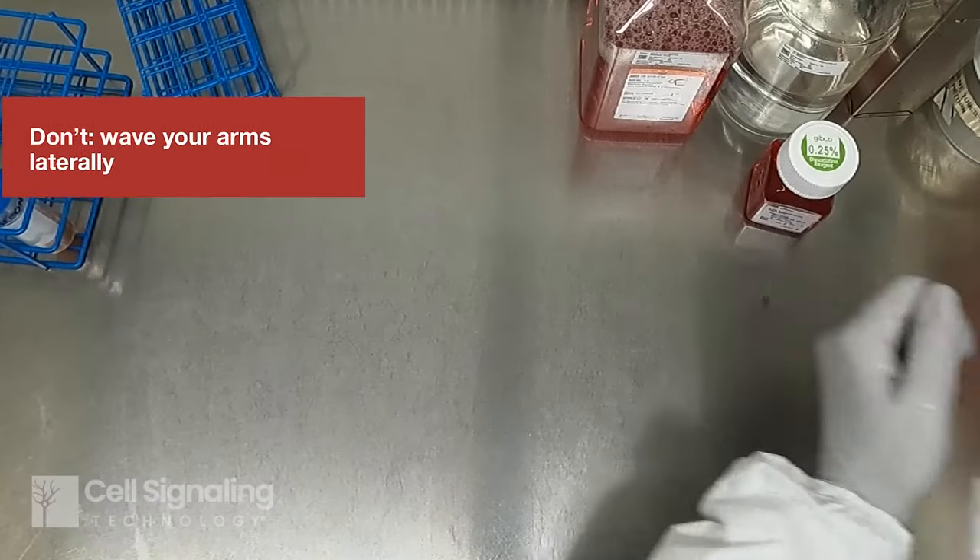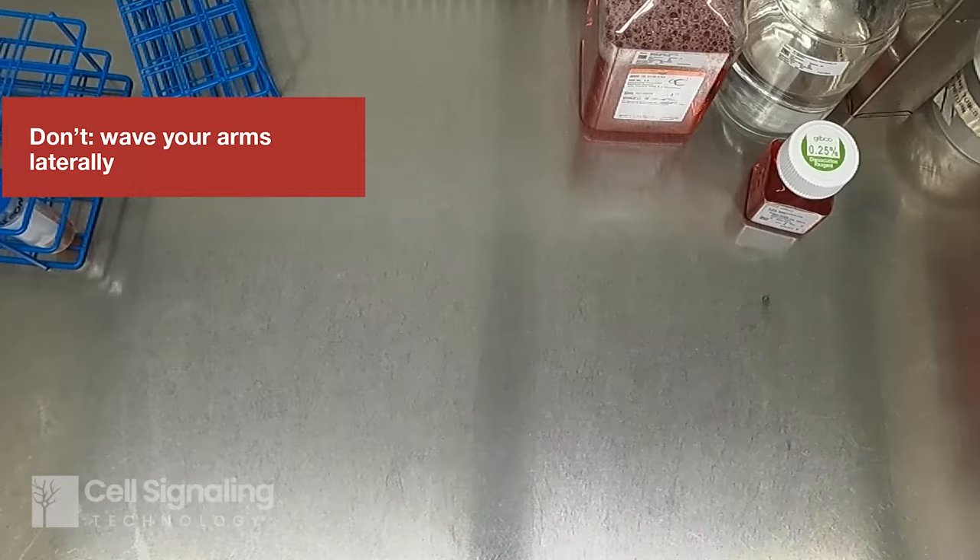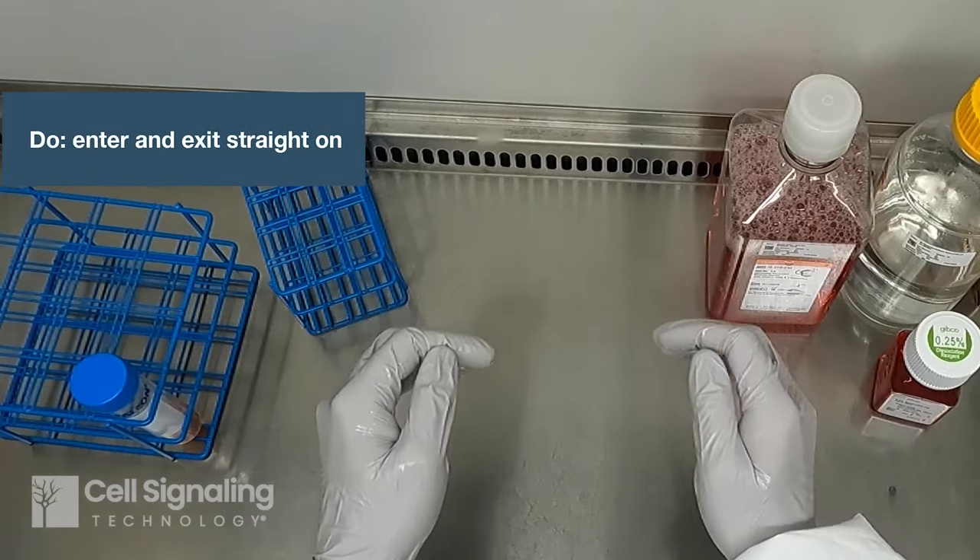To minimize disruption of the air curtain, avoid moving your arms laterally when possible. Instead, enter and exit the front of the cabinet straight on.